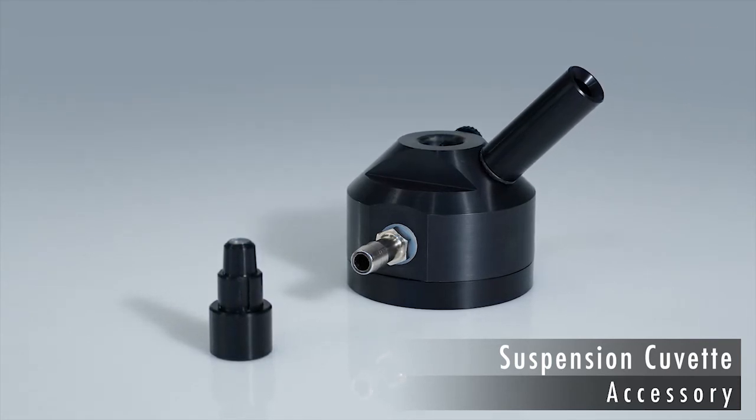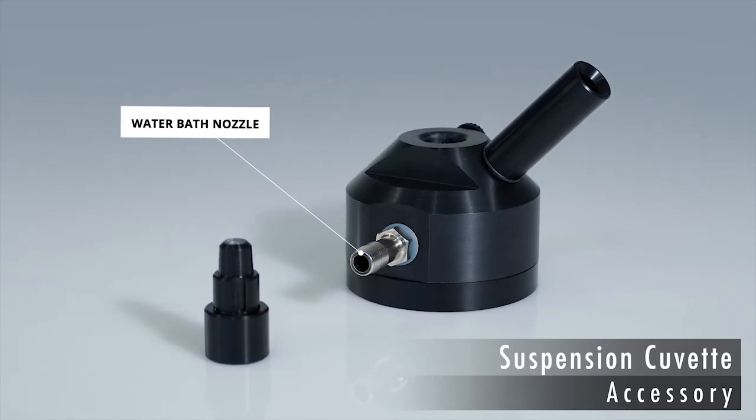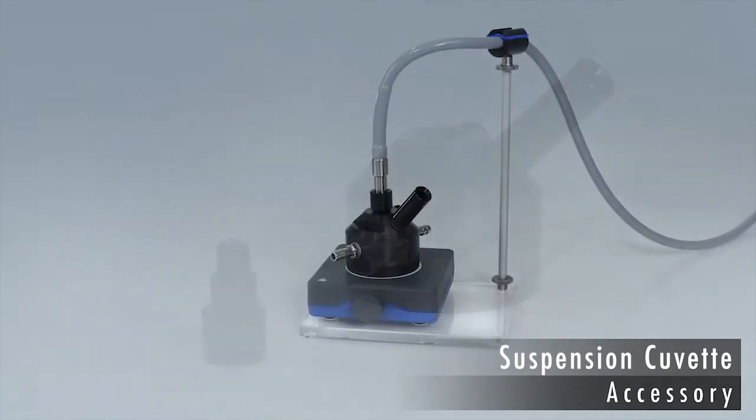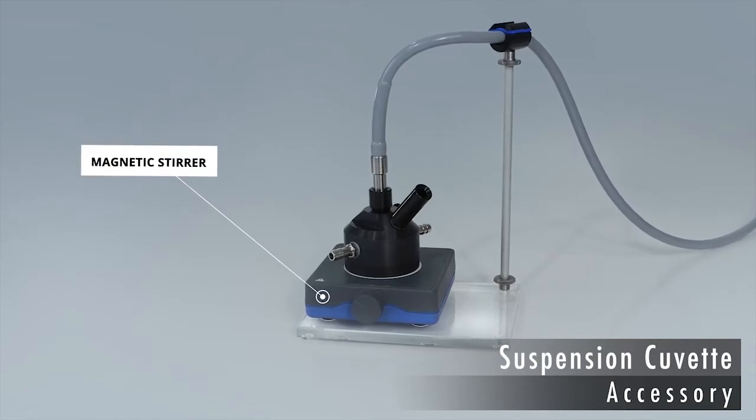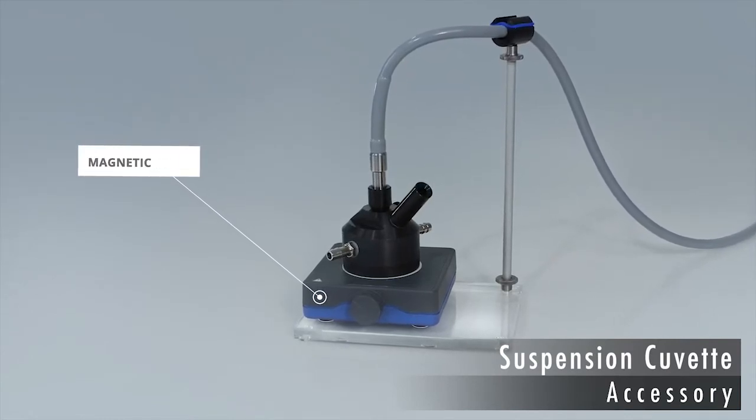Constant temperature of the suspensions is achieved by a flow-through water bath. A magnetic stirrer allows for the continuous mixing of the suspension.